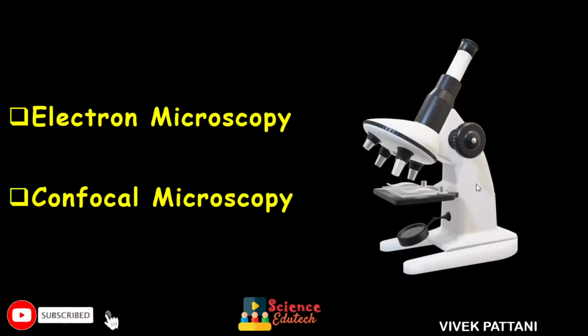Next comes confocal microscopy. Just a brief introduction. Confocal microscopy is basically the latest version of microscopy, which offers great advantages over conventional optical microscopes. One of the main ones is the shallow depth of field, elimination of out-of-focus glare, and the ability to collect serial optical sections from thick specimens.